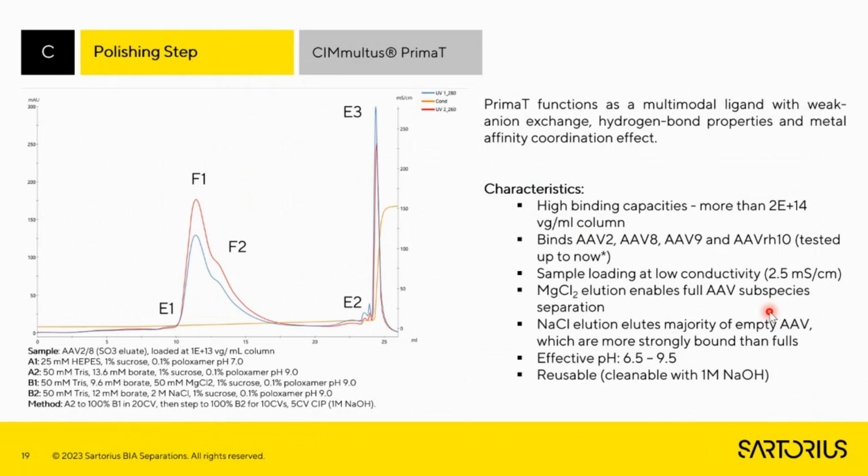So we designed such a column, since we saw that magnesium presence really affects the profile of the AAV. So we designed such a column that could exploit such traits.